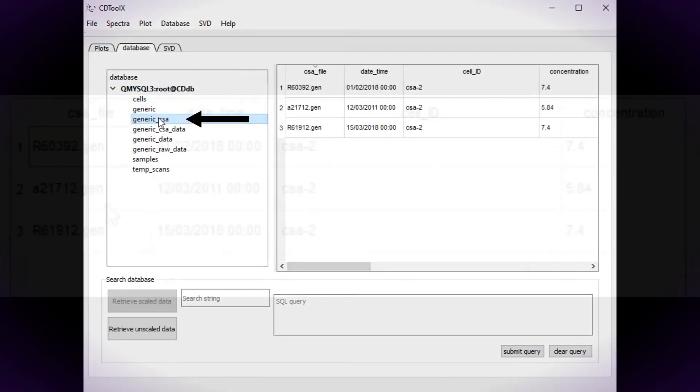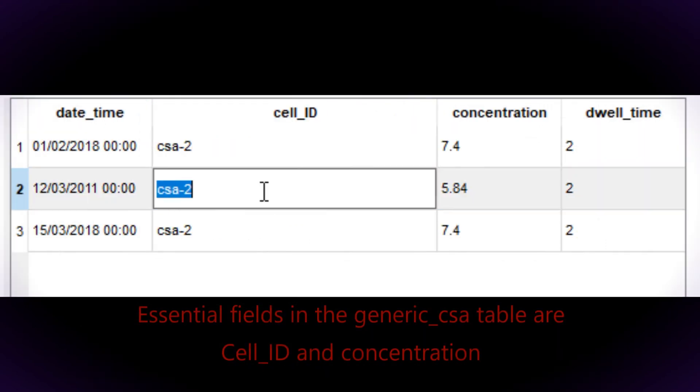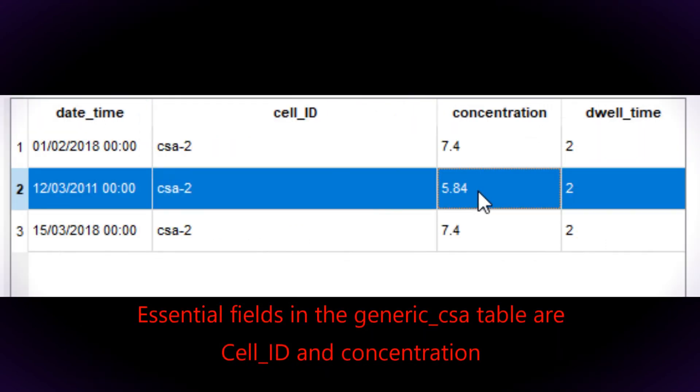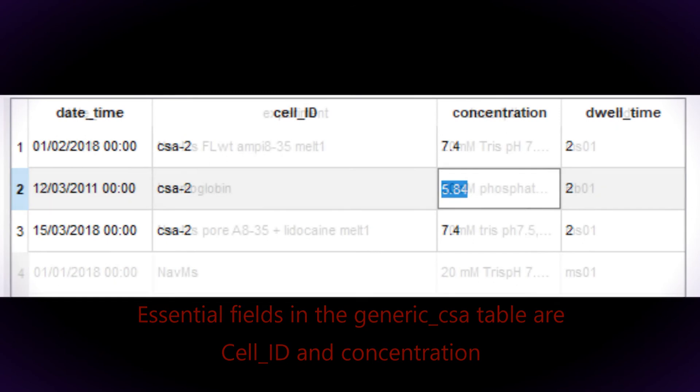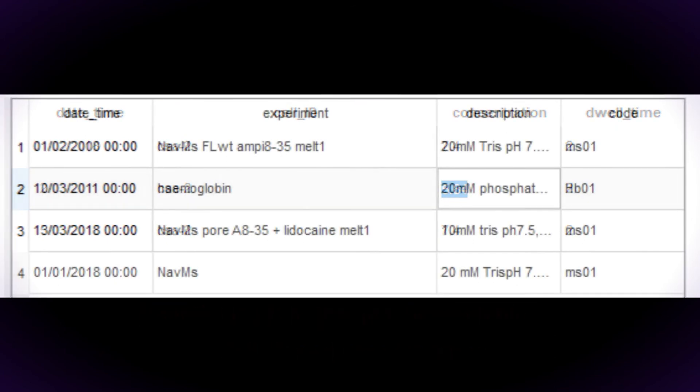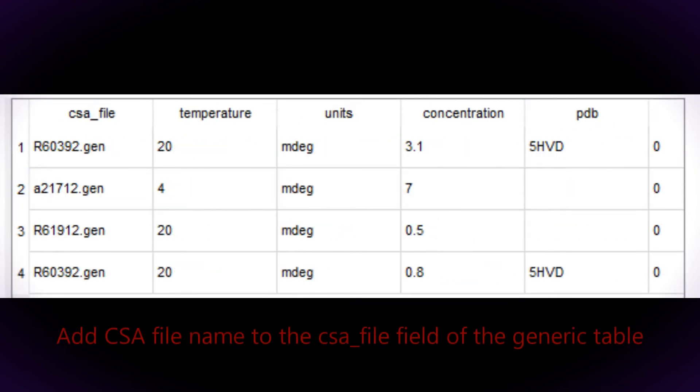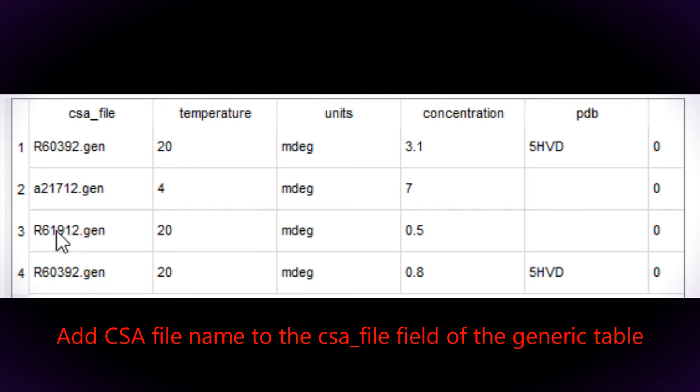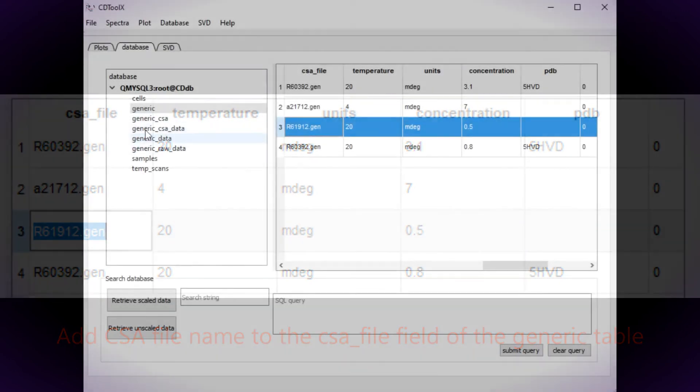The CSA Spectrum can be accessed via the generic CSA table. The cell ID and the concentration fields of this table must be filled in. The CSA file name is then added to the CSA file field in the generic table.